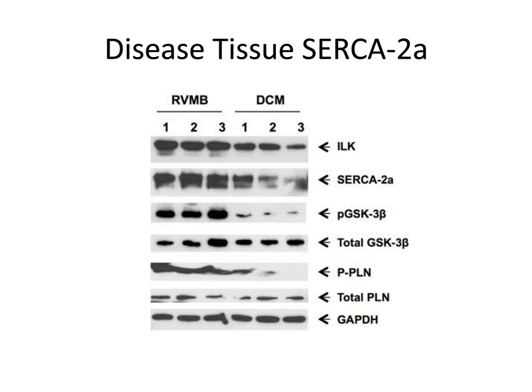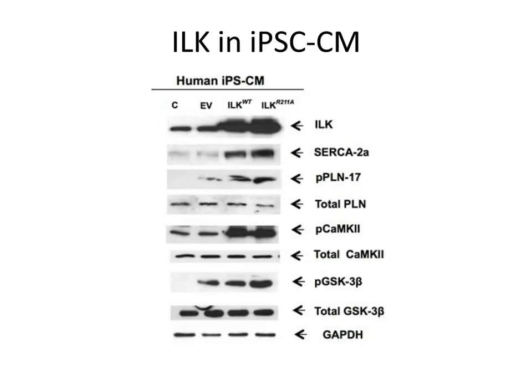So our next experiment was to go on and look at if we could recapitulate this cardiac phenotype, or therapy of this cardiac phenotype, in iPS cardiomyocytes, because we needed to have a cellular model that accurately represents the clinical picture. And so we have here an example of what happened when we overexpressed integrin-linked kinase in iPS cardiomyocytes.